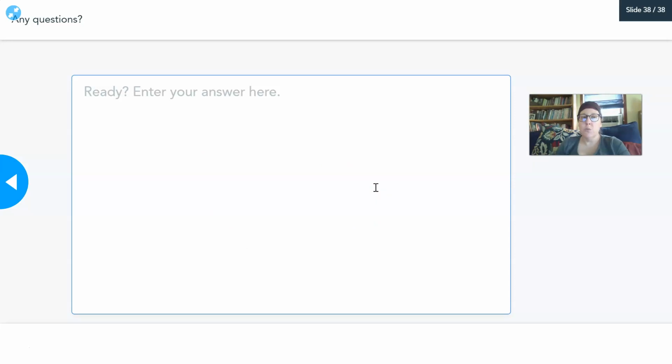As you work through your media lab and your Gram stain lab, you're going to get a better understanding of how this works, and you're also going to work on your microscope lab. The Gram stain lab is coming up next. While you're working on tools of the lab, you have labs on the microscope and labs on the different types of media. If you have any questions pertaining to this lesson or anything that you need, just pop it in here, and I'll answer it as an announcement.